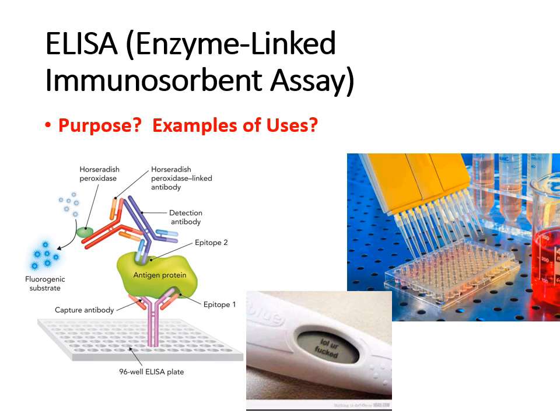And again, it's the same thing we mentioned with Western blot, in that you would have a primary antibody specific to the antigen you're looking for. And then you have a secondary antibody. So in this image, here's the primary. You have the secondary antibody that has a form of detection on it that can then do something like change color. So only the wells that have the antigen you're looking for will change color, whereas the negative ones will not.